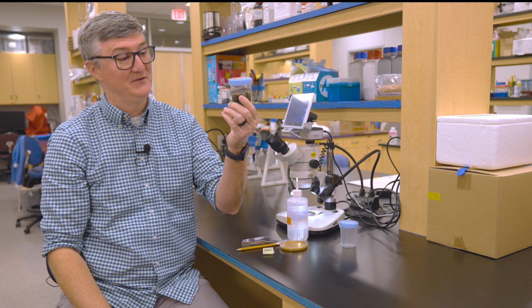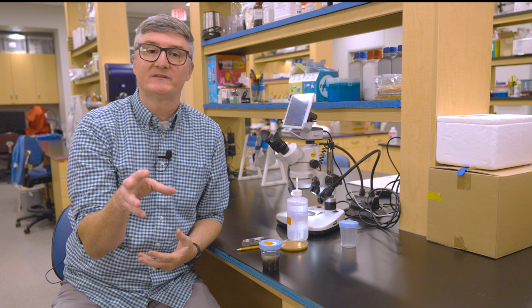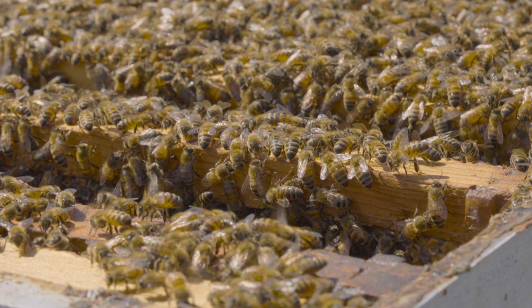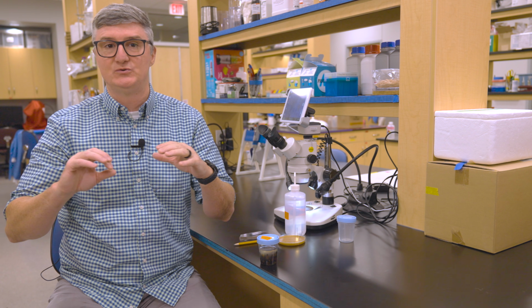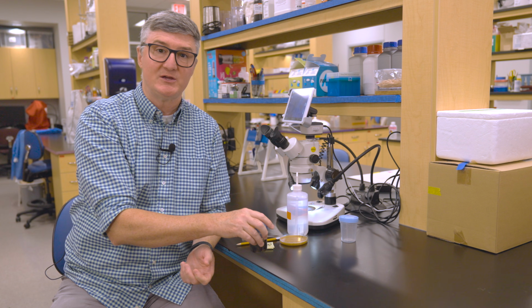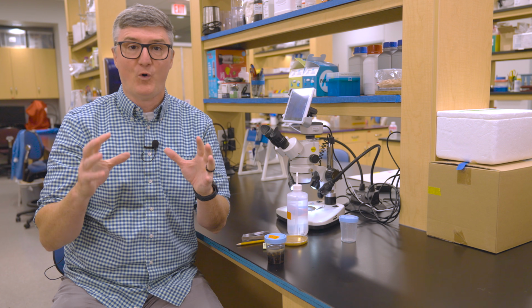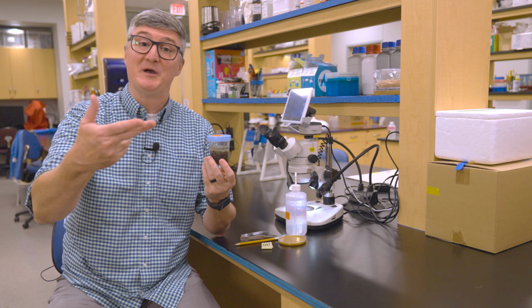I just happen to have a container with collected bees. You really want to do these dissections with freshly collected bees. You don't want to go outside the hive, see dead bees on the ground, and try to do the dissection with dead bees. The tissue's just too hard, it's too dry. Using freshly dead bees, bees that you euthanize yourself by putting them into isopropyl alcohol, ensures that you're going to have the highest quality specimen for that dissection. Now that you've got your bees in isopropyl alcohol, you're ready to do the dissection.